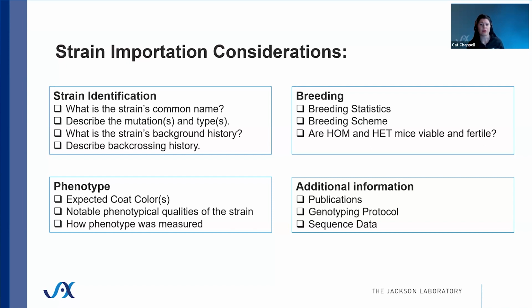If the collaborator you're getting mice from can send positive control DNA, definitely ask for that. That is so invaluable when it comes to having the optimization done and making sure that that protocol works for you. QC for strains is really, really time and resource and effort intensive.